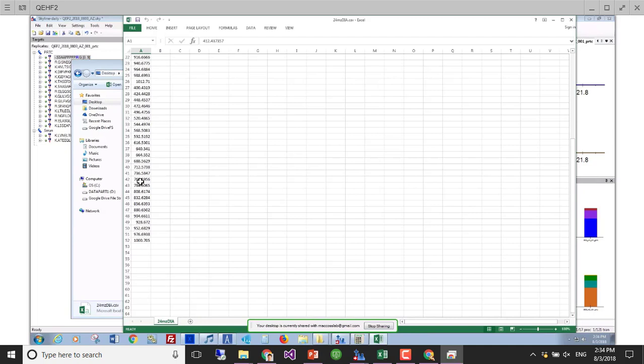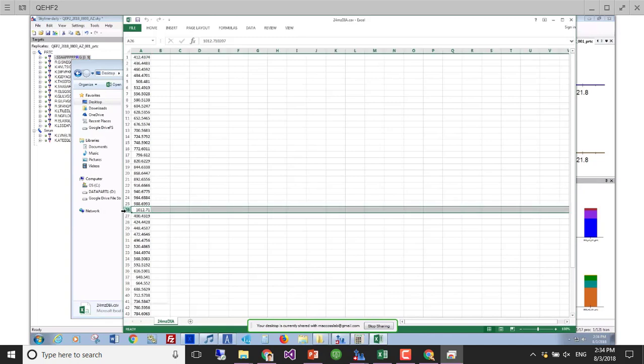So one of the things that you'll note is that there's actually a little bug here in Skyline, which, Brendan, you should fix at some point. There's this extra window that's created, this 1012 window. The 1012 window is going to go from 1,000 to 1,024, right? Do we care about that window? We don't really. So the first thing that I'm going to do is delete that window out. Okay, so that's just a reminder to know that Skyline will create a fake window that you really don't actually care about.